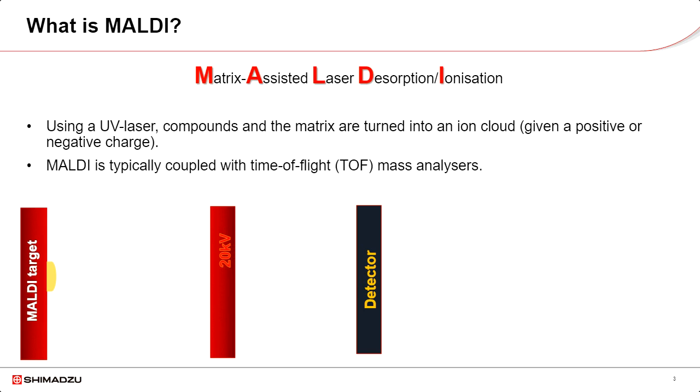MALDI is typically coupled with time-of-flight (TOF) mass analyzers. The following animation illustrates the key steps of the process. The laser fires a pulse of ionizing radiation at the sample. The matrix and the sample absorb the laser energy and become ionized.